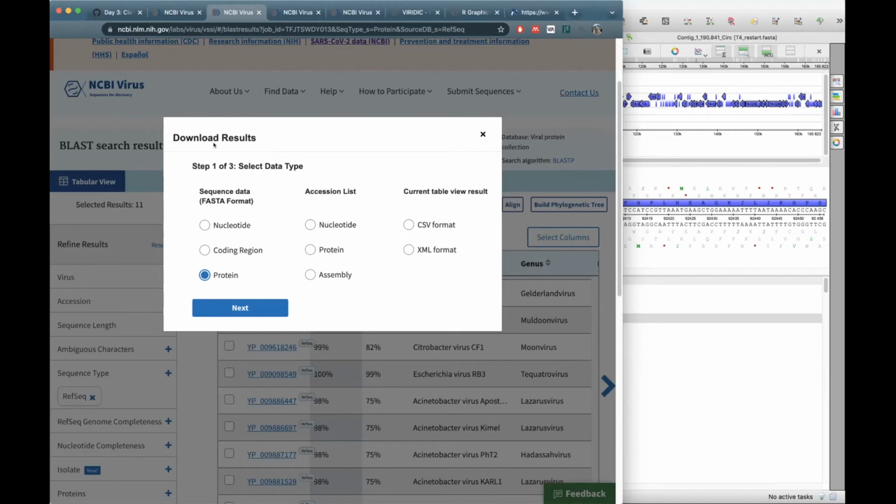Because I mean, it depends on the selection criteria that everyone has, right? So yeah. One of the things is that when you build a tree, you can't have too many sequences, and then it depends also on the gene length. So how many amino acids do you have?